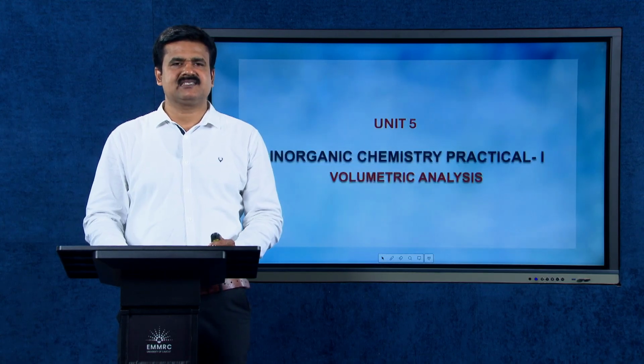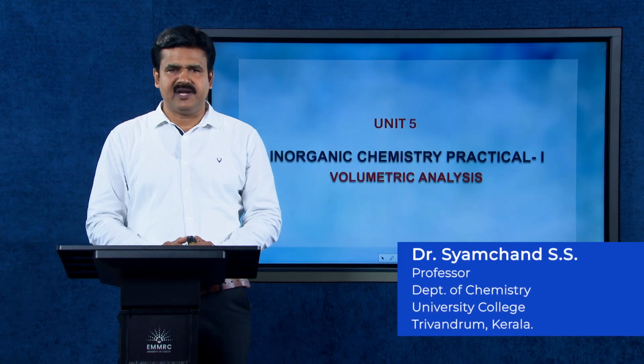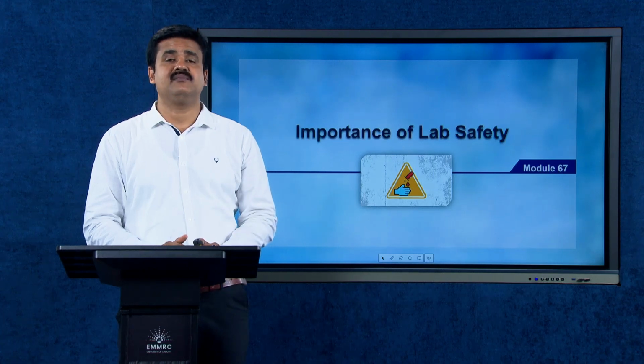Welcome dear learners. We are continuing Unit 5, Inorganic Practical 1, Volumetric Analysis. In the present module we are focusing on the importance of lab safety.